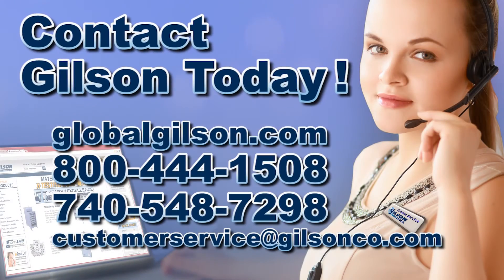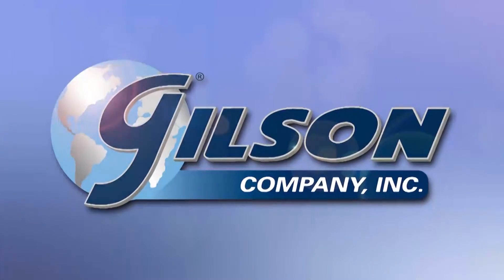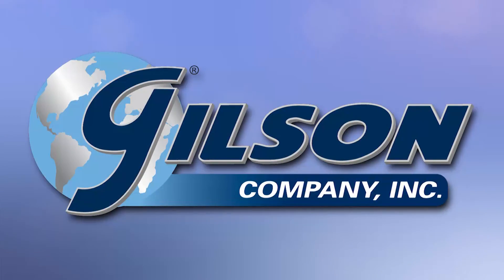Be sure to check out these and all our sieve shakers listed in the Gilson catalog and on the Gilson website. Gilson — your industry leader in material testing equipment.